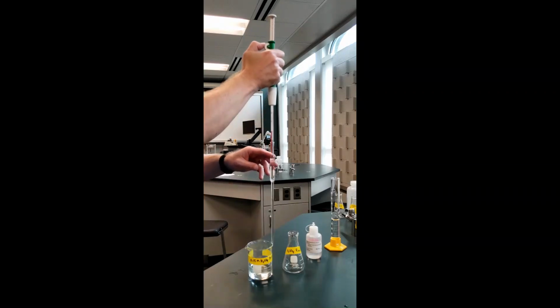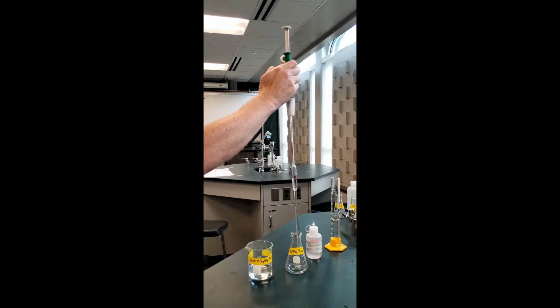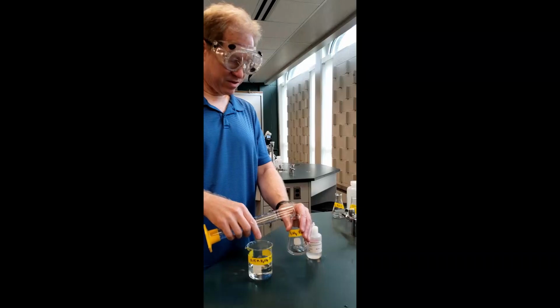Okay. And then I'm going to just transfer here. Hit the trigger. It will release the sulfuric acid. And that's 10 mils of it. And I'm going to do this 2 more times. I'm not going to show you them, and I'll show you the end result of them. But this is good for, see how it works, and then put in the 50 mils of distilled water.